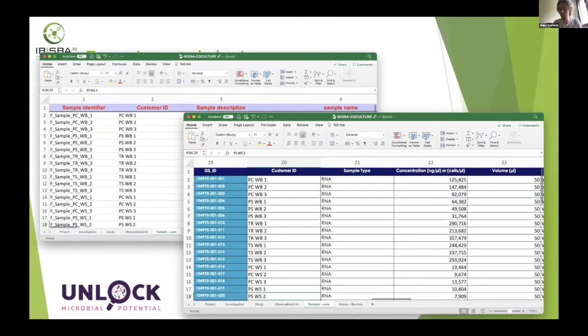So this is then an example. We first use a website where we can select what kind of observation you are going to do. Are you going to observe plants, animals, bioreactors? What kind of samples are you taking? Because these different samples require different kinds of metadata. And then we can start filling in all this information. This is often done by the researcher themselves while they're doing experiments.